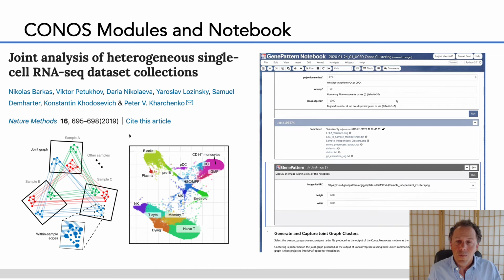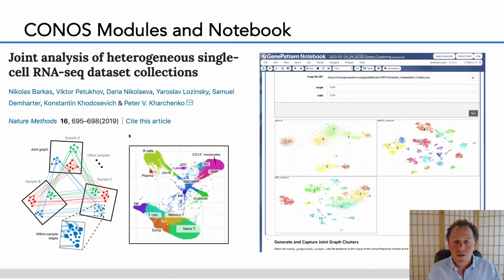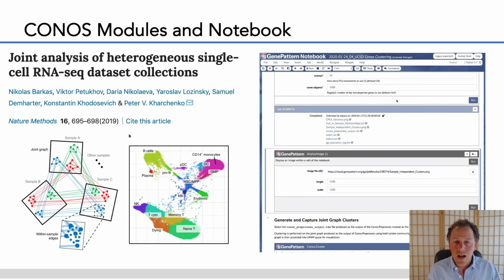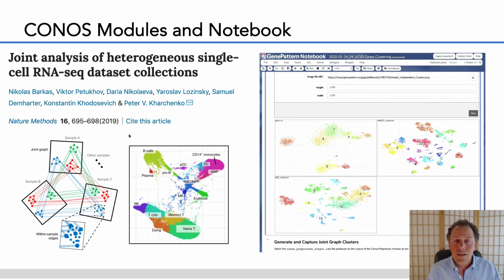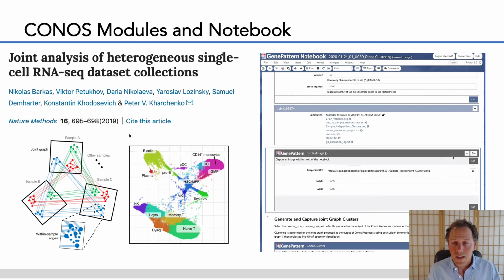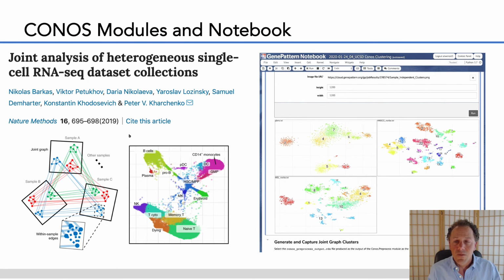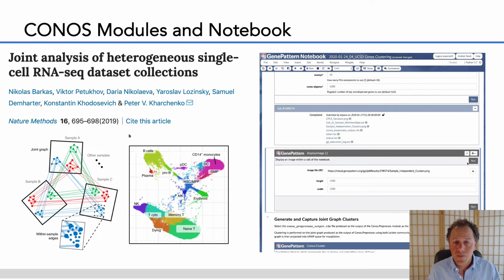As the volume of publicly available single-cell data has increased in recent years, many researchers are focused on similar topics, such as immune cell and tumor interactions. There's growing interest in being able to harmonize or align different data sets that were collected in different labs or slightly different experimental conditions, but that still in theory describe similar biology or are expected to contain similar populations of cells.